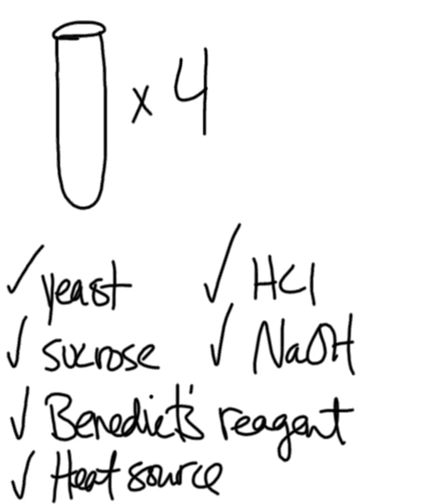So we have yeast and sucrose available to you. You're going to have Benedict's reagent, you're going to have a heat source, and you're going to have some hydrochloric acid and some sodium hydroxide. Again, they are going to be fairly low concentrations. Okay? You are not going to need closed-toe shoes for this lab, but like I said, make sure you bring these notes and some more paper so you can take better notes during the lab.